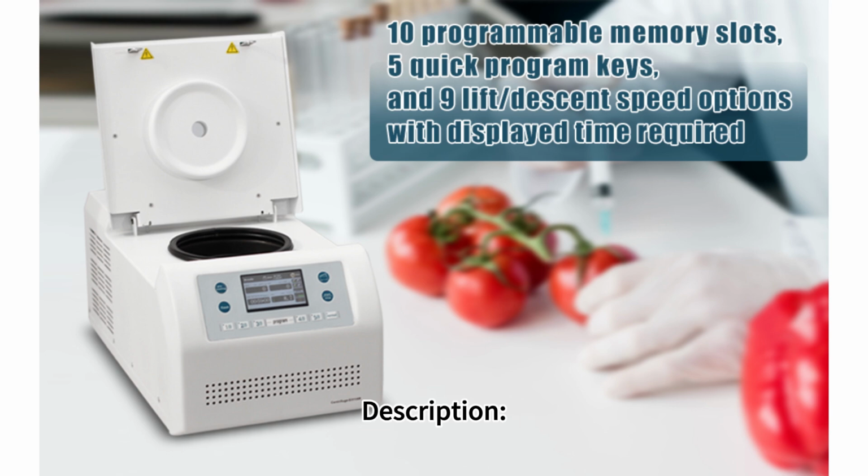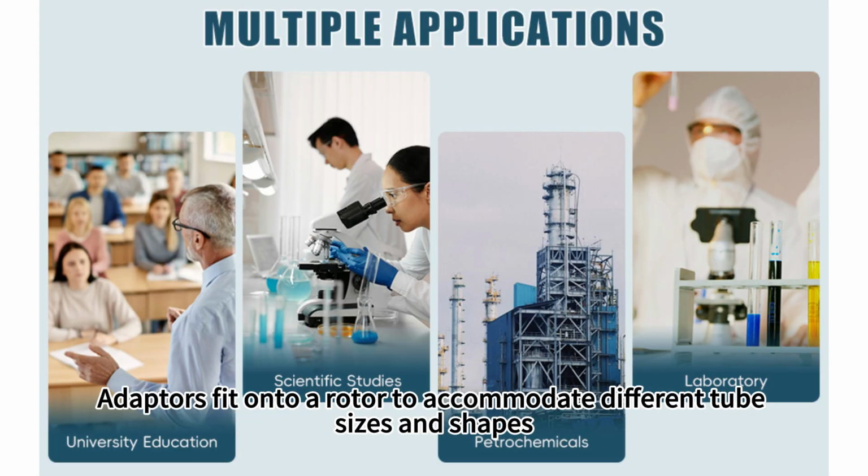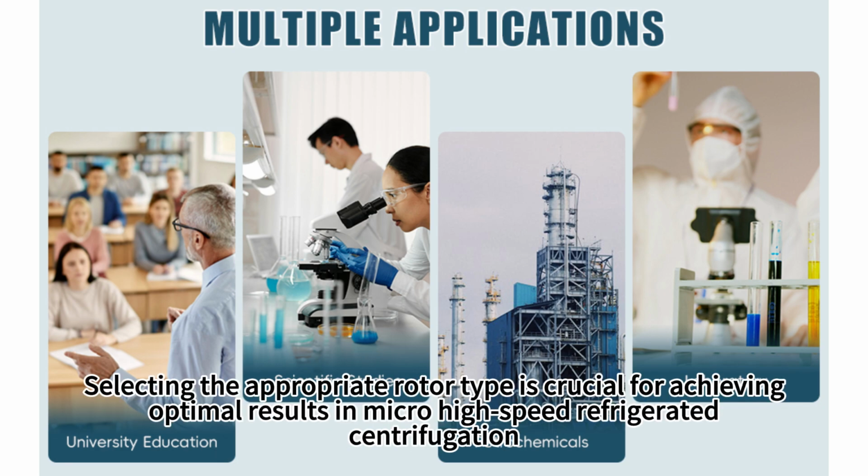Adapter rotor. Description: adapters fit onto a rotor to accommodate different tube sizes and shapes. Suitability: provides flexibility for using a variety of sample containers with a single rotor. Selecting the appropriate rotor type is crucial for achieving optimal results in micro-high-speed refrigerated centrifugation.